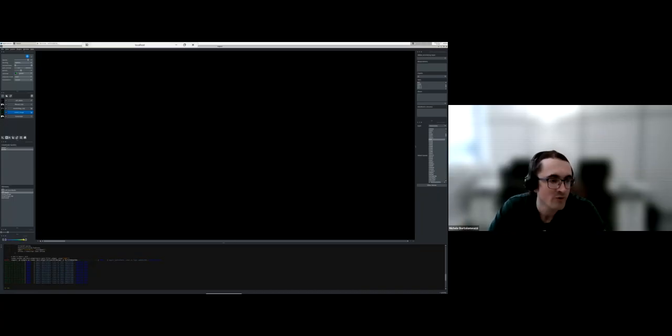But you also see it a lot when working with Visium and Visium HD, to move between the different resolution levels that this type of data shows when you load it into SpatialData.